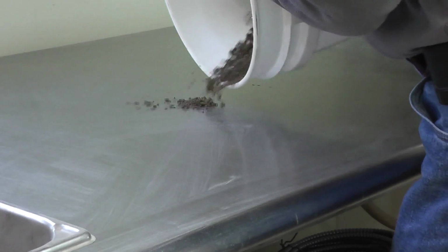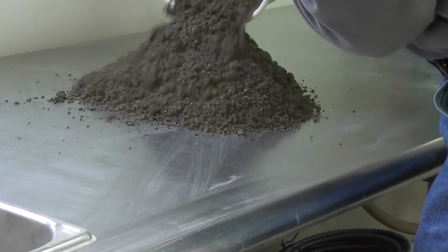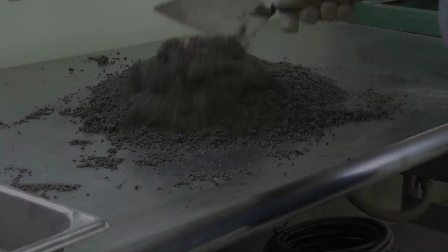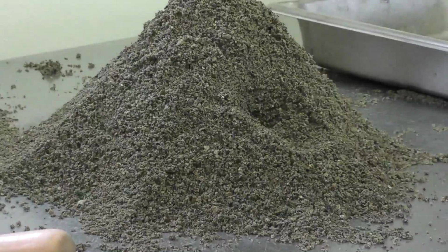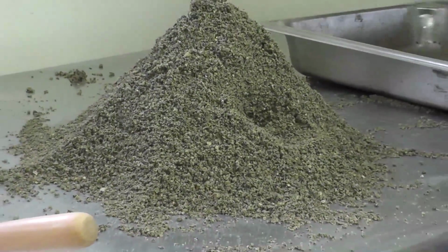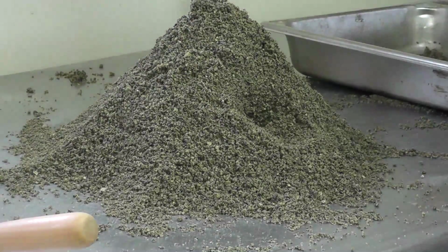Now let's have a look at Method C, miniature stockpile. In this method, a sample is also placed onto a hard, non-porous surface, mixed, and then shaped into a conical pile. However, instead of quartering the sample, a sampling spoon is used to remove portions of the miniature stockpile. These portions are then combined to form the final test sample.